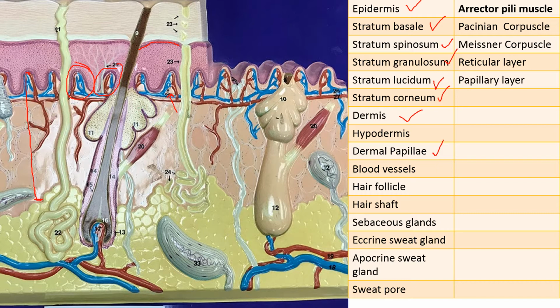And then that deoxygenated blood is carried via these little blood vessels, these little capillaries that are connected to your veins. And the veins are going to take that material away back to the lungs and heart. So these are blood vessels. They are specifically called capillary loops. Okay, blood vessels right here.